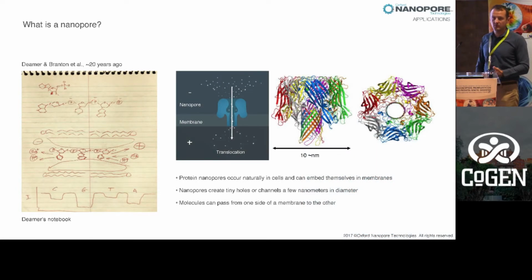So first thing is, what is a nanopore? As the name suggests, it's just a very, very small hole. Over the last maybe 3 decades or so, the academic community has shown that nanopores can be used as very, very versatile sensing devices, tools. They've shown that it's possible to use nanopores to quantify things such as TNT or recreational drugs or proteins. And about 20 years ago, a patent was released that talked about using nanopores to sequence DNA and RNA. That's what I'm going to be concentrating on today, although not the RNA side, although we can do that. I'll be talking about DNA.